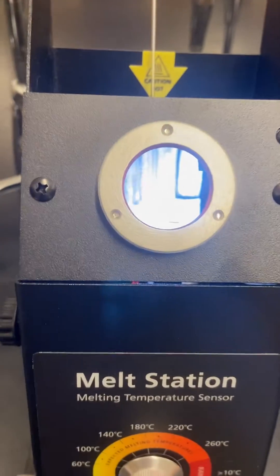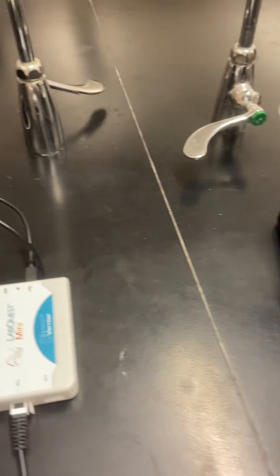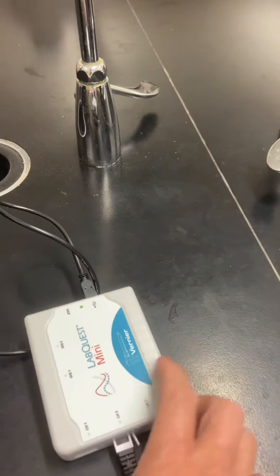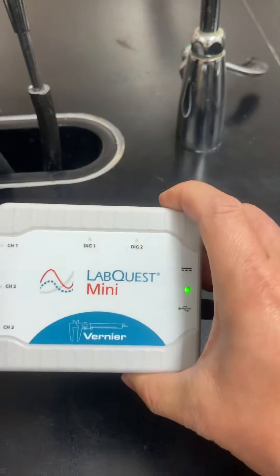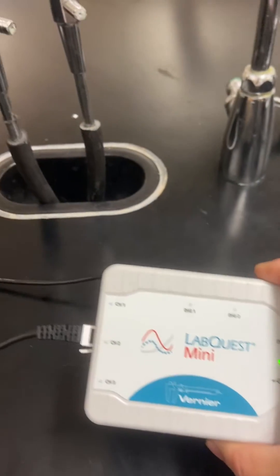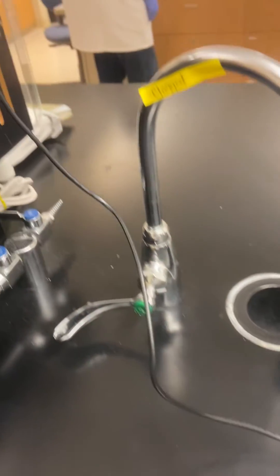The melt station should be connected to a component called the LabQuest Mini, and this is connected to the PC.